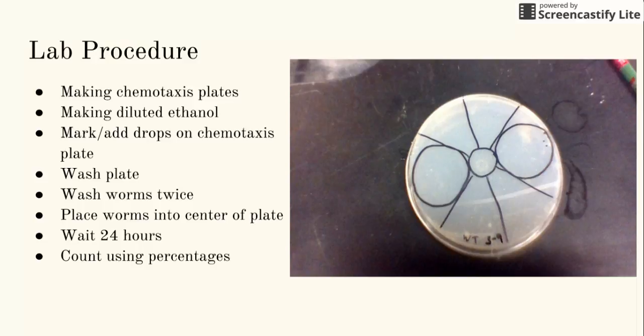Before even washing the worms, we added the drops of ethanol and water to their appropriate sides. To clean the worms, we took a syringe with 0.5 milliliters of water and angled the plate. Pouring the water all over the plate, we took another 0.5 milliliters of water and did the same thing. Picked up the worms with the pipette and transferred them to a microtest tube, placed them in our centrifuge.